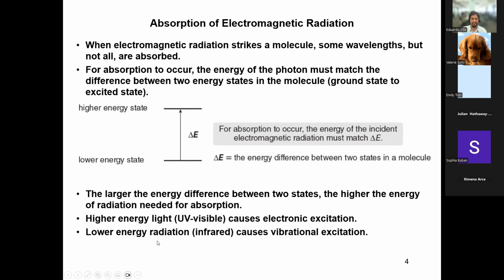So this is basically what I said, right? Depending on the type of energy that you have, you get different types of absorption and re-emission. So again, this is mostly physics. You don't really need to know the actual physics or the physical equations, but you do need to understand the process, right? From what I've seen on the final exam, you mostly get asked about relationships, like what is the relationship between energy and frequency, or what is the relationship between energy and wavelength, right? So you don't necessarily have to do physical equations, but you should understand what they mean or what the relationship between the two is. So any questions before I move on?